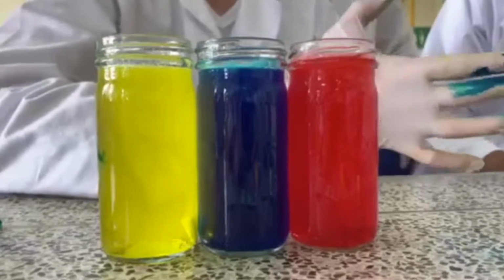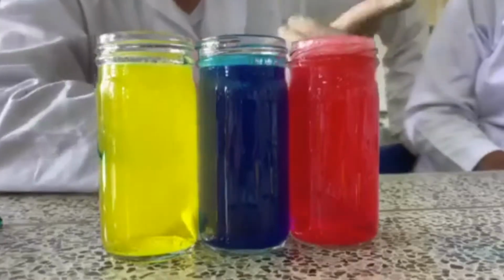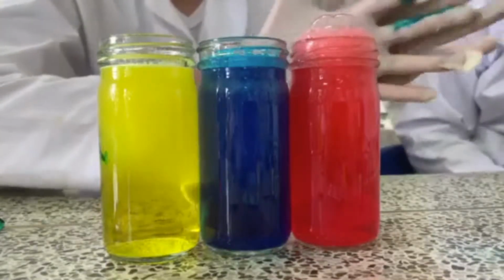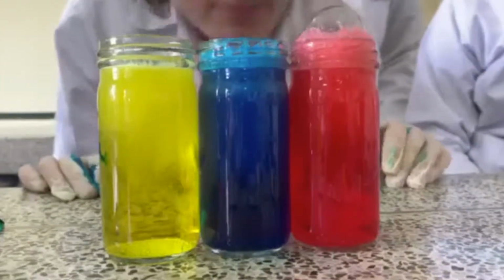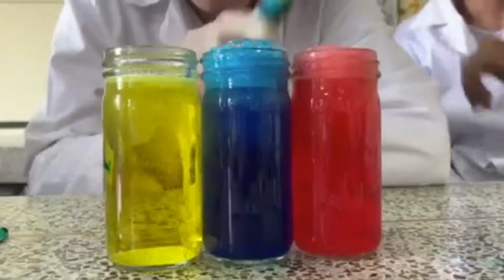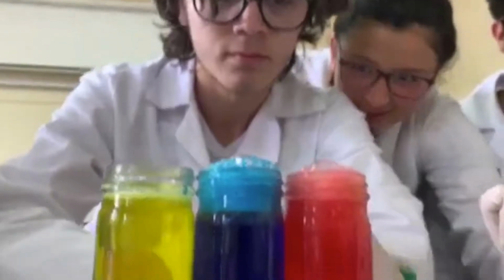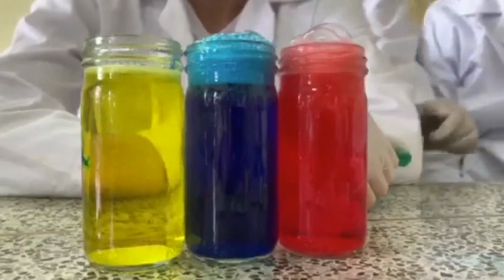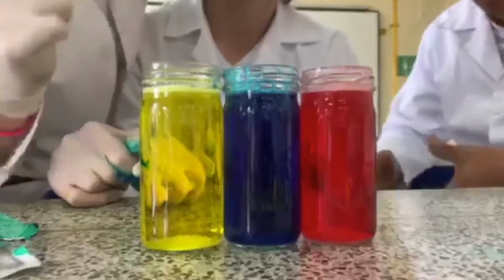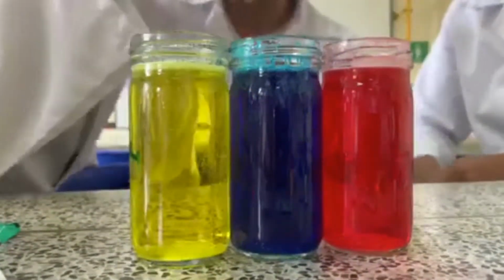The procedure for this experiment is the next one. First, we take the 3 beakers and add 200 milliliters of water in each one. Then, we add some blue dye to one of the beakers, yellow dye to another one, and red dye to the last one, in order to differentiate them from each other. Then, we add 2 effervescent aspirins to one of the beakers, and then just 1 effervescent aspirin in the other 2. Measure the time with a stopwatch from the moment the aspirin has been added to the beaker till the end of the reaction. Finally, write down conclusions and results about the experiment.